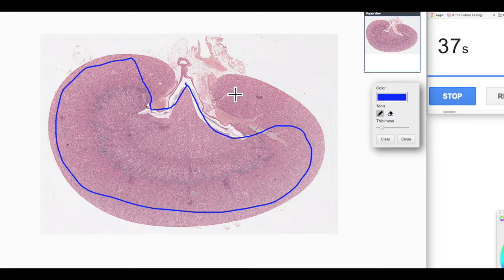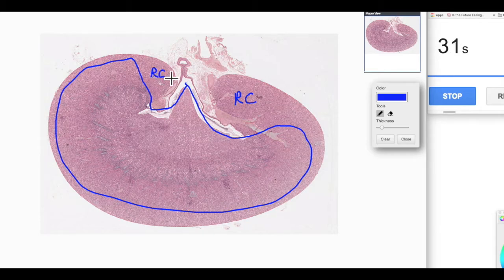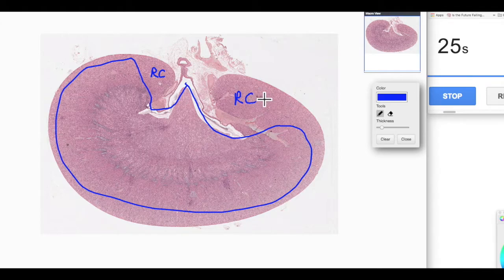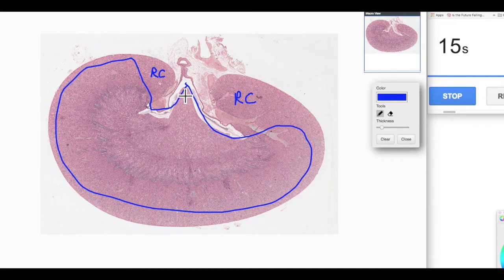They contain cortical tissue. So they're where we find all the proximal distal convoluted tubules, the medullary rays, and of course, the renal corpuscles. This is cortical tissue. All the nephrons within here actually drain all the way back around and then come back and drain into this one renal pyramid here, renal papilla.